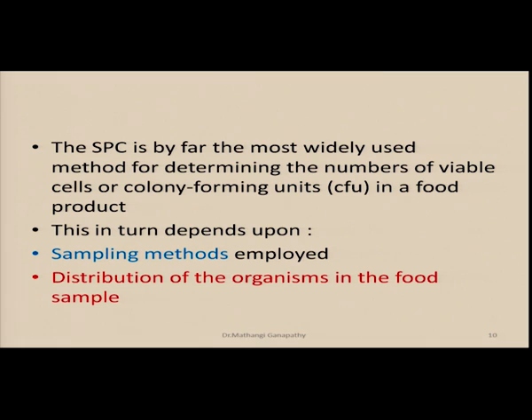So, suppose you scrape off a sample from the food, dissolve it, suspend it in a medium and then plate it on an agar plate. If you see 100 colonies, it means that each of these 100 colonies, each single colony, is the progeny of one bacterium. So, you had 100 microbes in that particular sample, or in whatever aliquot, depending upon the dilution you took. So, each single organism forms one colony. This is called a viable colony forming unit.